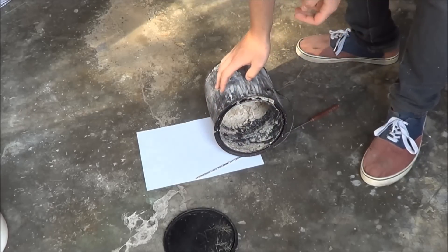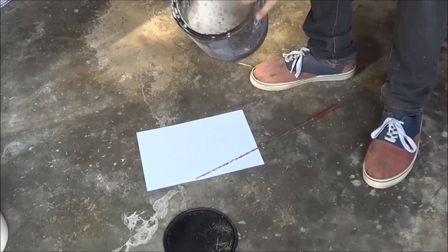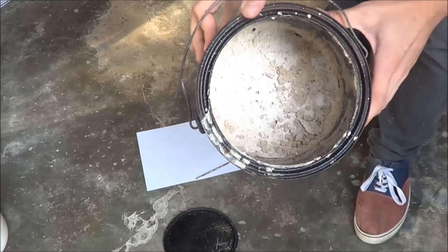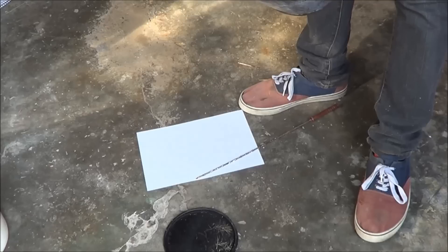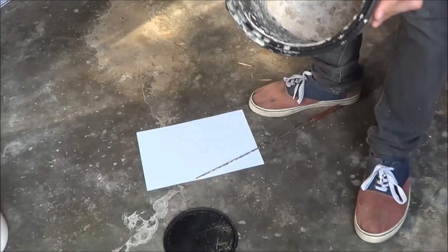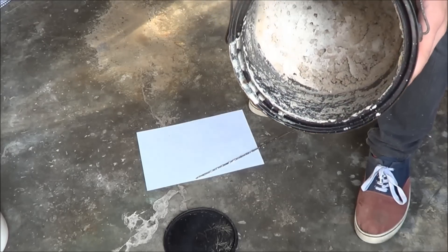That's basically by calcinating this solid — very high heat and without oxygen — and it's going to form the calcium cyanamide. It's going to be a little difficult because it is quite high heat, and also preventing the oxidation of it is always an issue.